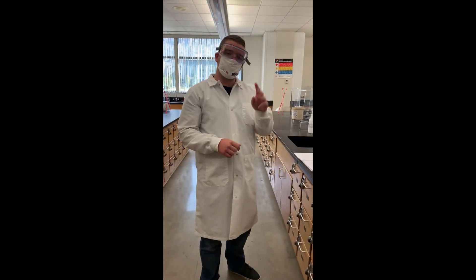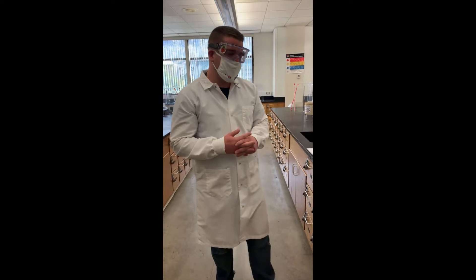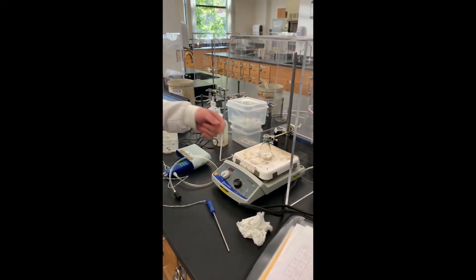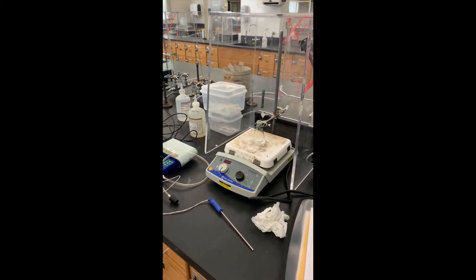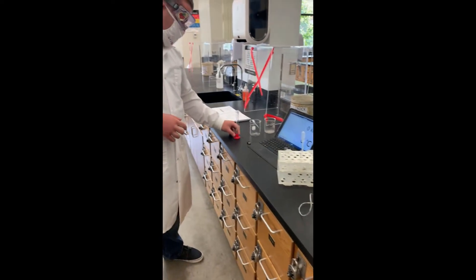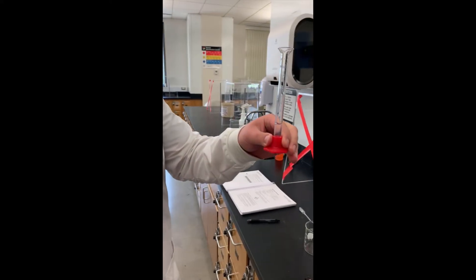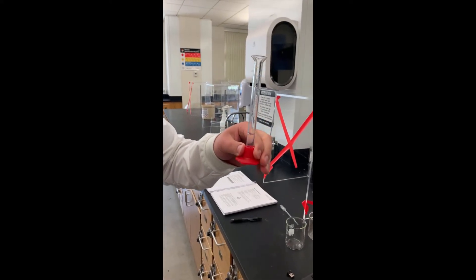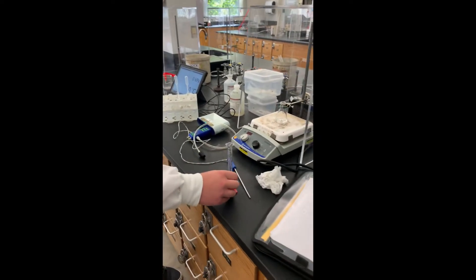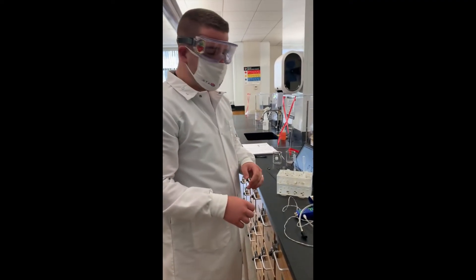I'm going to do three sample trials for you today. I'm first going to start with a standard trial. So far I have six milliliters of water in here and I also have one milliliter of hydrogen peroxide. In my graduated cylinder here I have about three milliliters of the catalase solution. So we're going to run this first trial and see what kind of pressure readings we get.